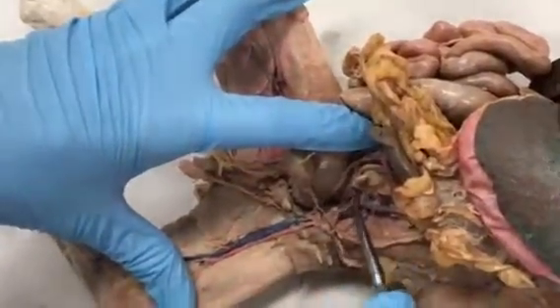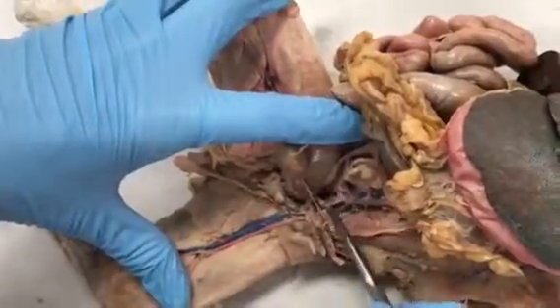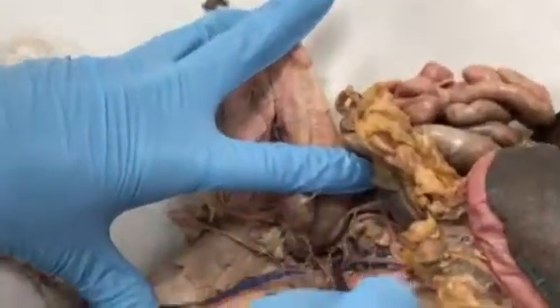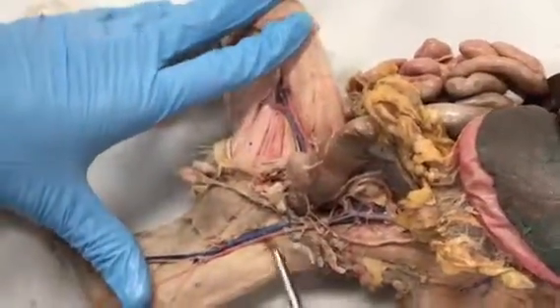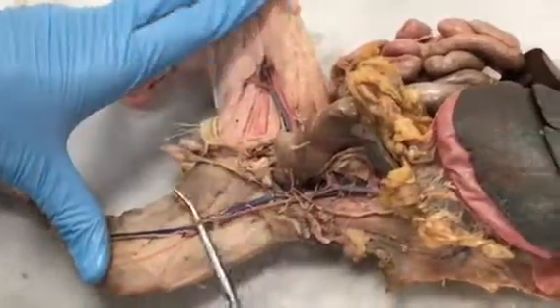And here's your right external iliac artery. It branches again and becomes the left and right internal iliac arteries, and then you have one more branch that goes straight down towards the tail, and that is the caudal artery right there. Now, as the external iliac arteries continue out, they become the left and right femoral arteries right here.